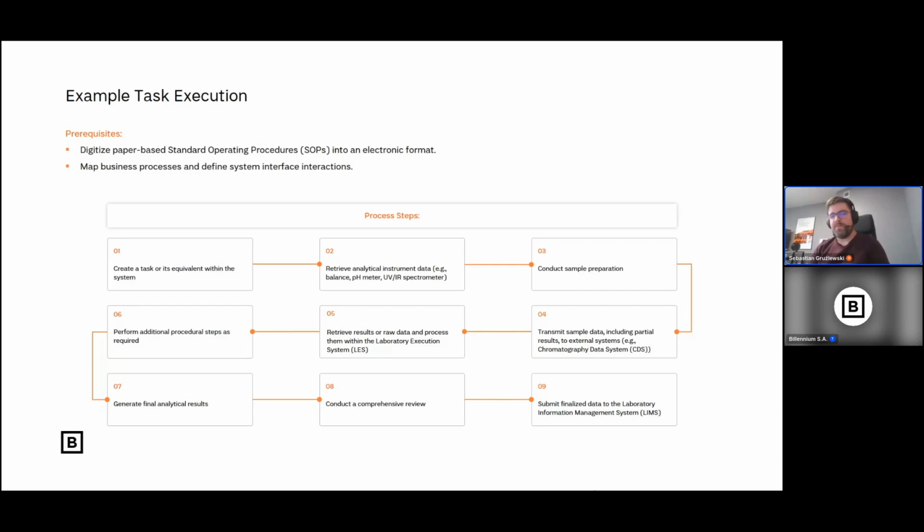Well, you end up with a giant mapping table that has all your methods from one system linked to methods in another system. This may be really problematic, because you will end up with a giant table of thousands of entries that needs to be reviewed and audit trailed, because of all the requirements we have. And also, it's just really hard to maintain, just because of its scale.